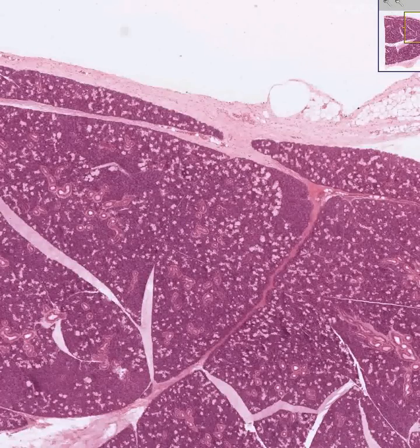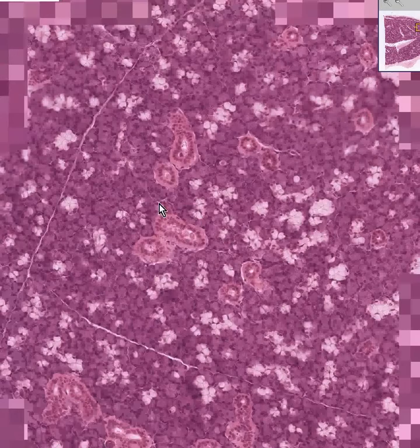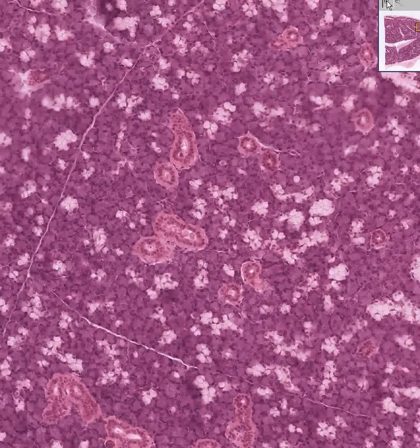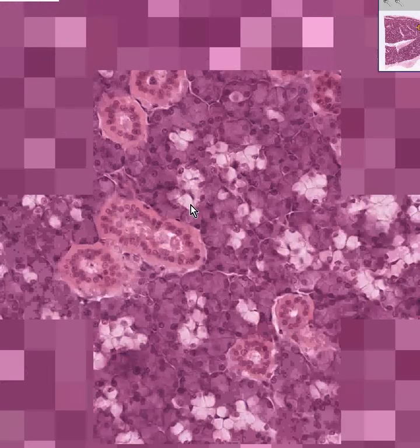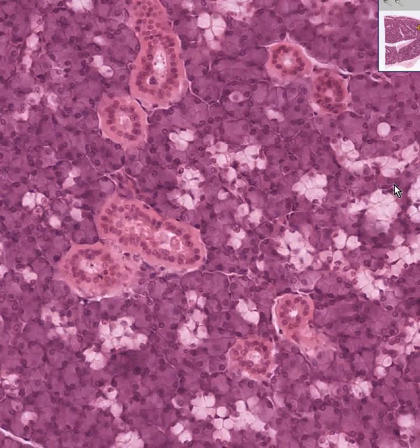Here is another salivary gland, but it is not 100% serous. As you zoom in on it, you can see that these whitish areas, which have the classical staining properties of mucin — they are white and washed out and have the nucleus displaced more towards the base — are the mucous glands.